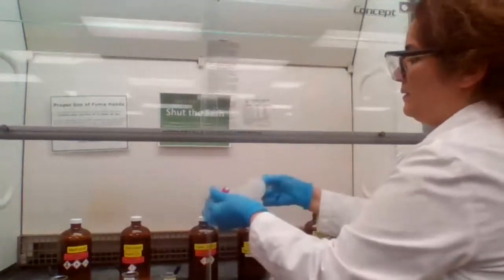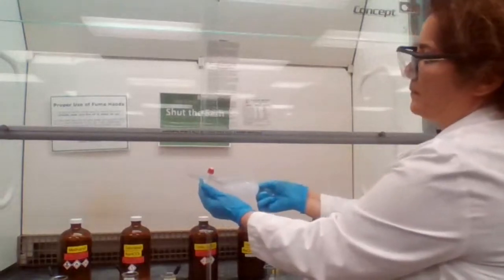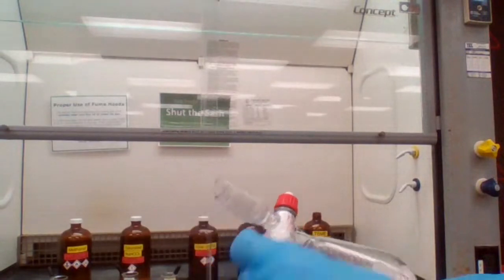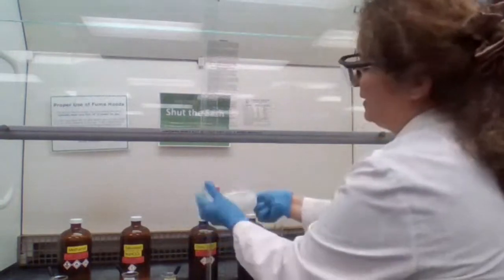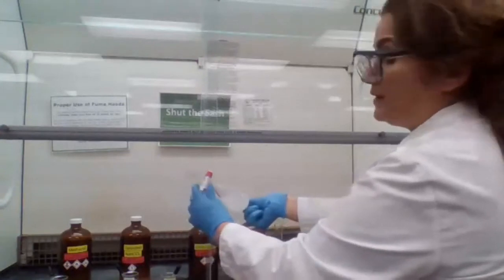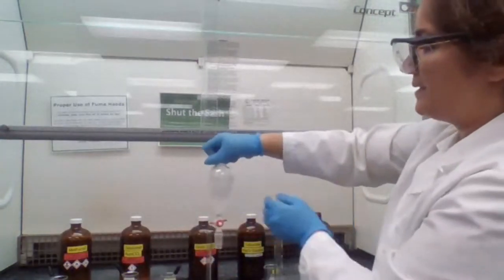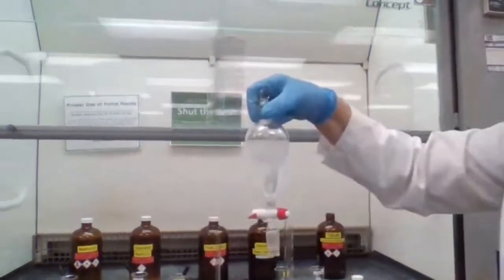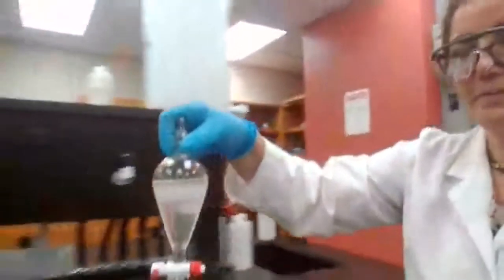Open to release the pressure. Don't know if you hear or not. See the fizzing sound? There is no bicarbonate yet, so it's not that strong. Okay, so for three times, I shook it and vented. Now I'm taking it back to the station. I leave it on the ring stand and take the stopper out for the two layers to form.